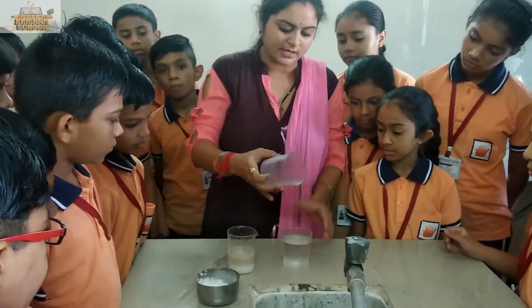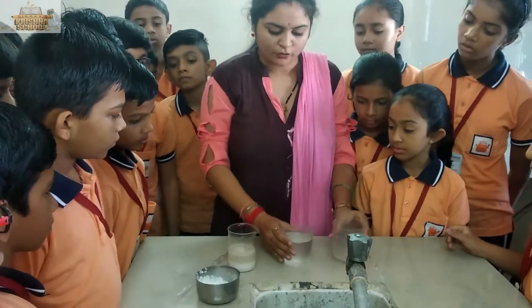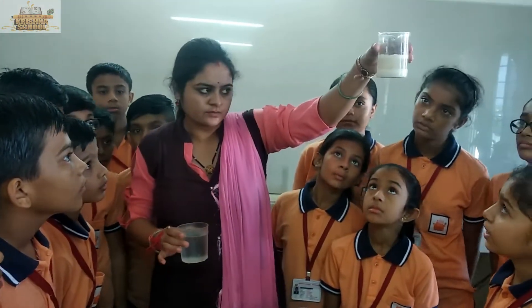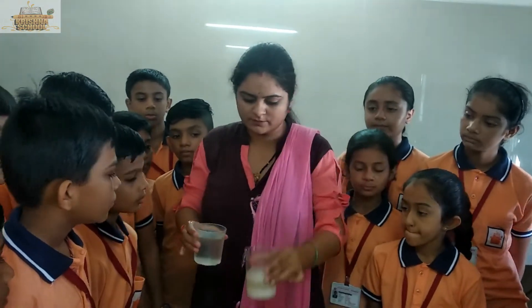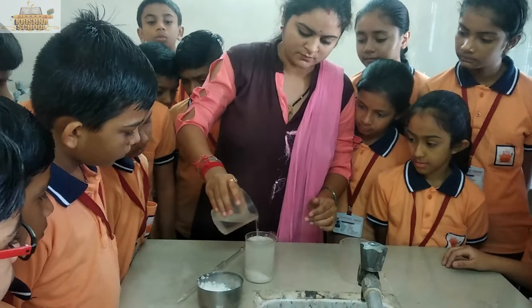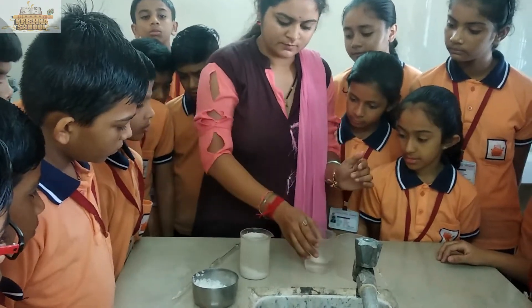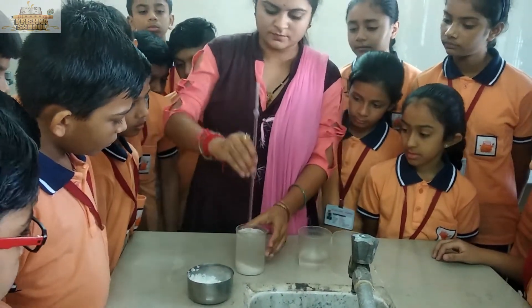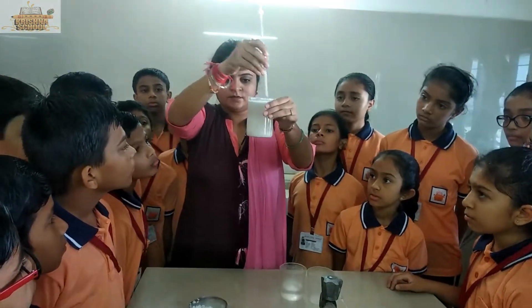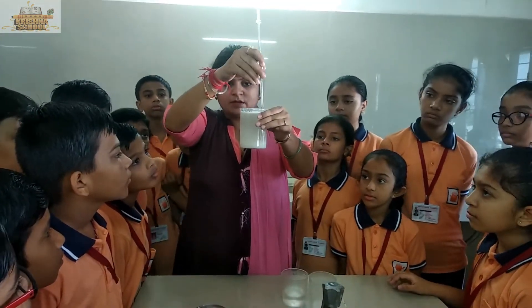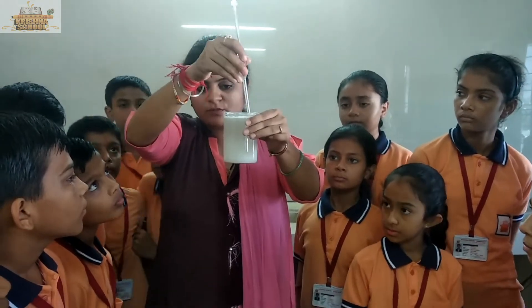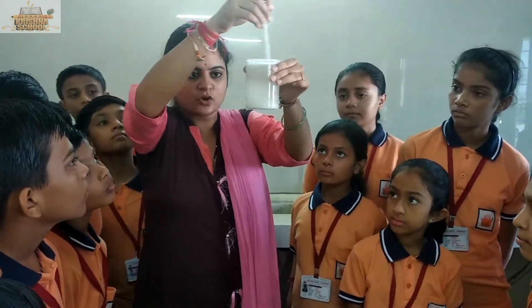Now we will add some hot water. Solute particles are seen by you? By stirring it continuously, we can see if all particles are now starting to dissolve.